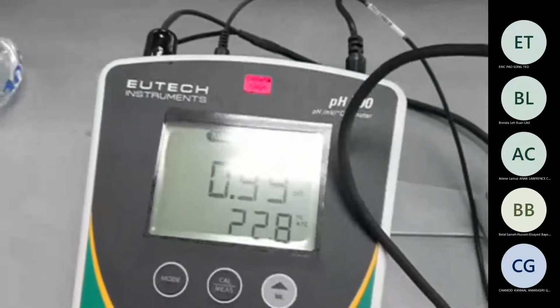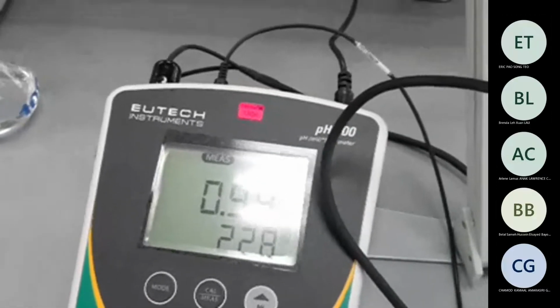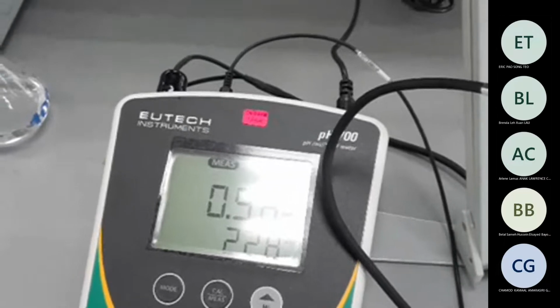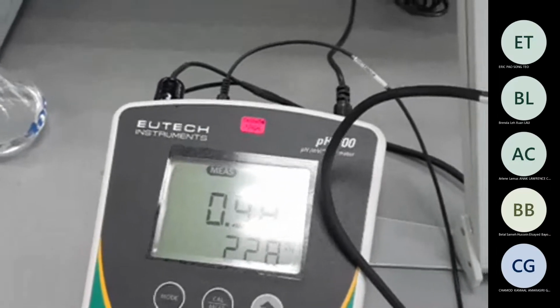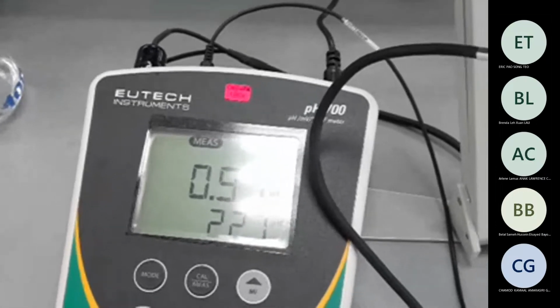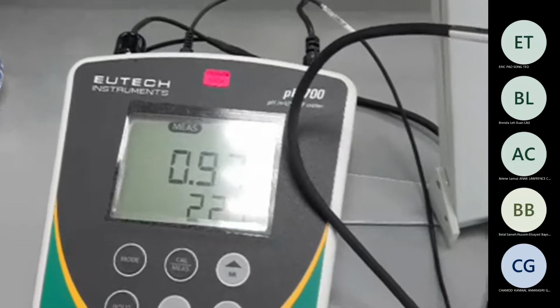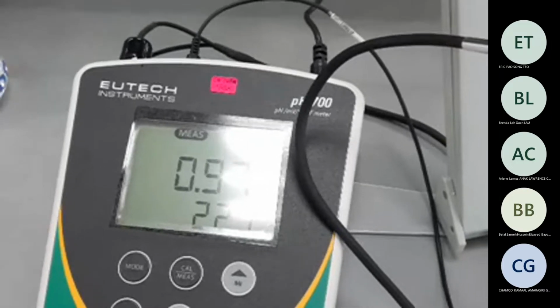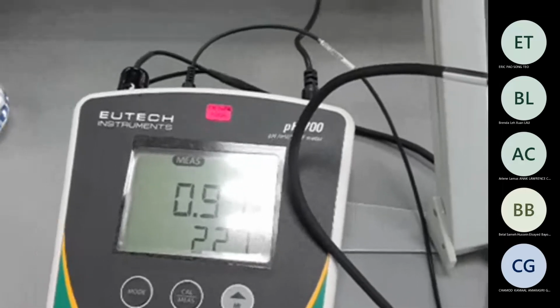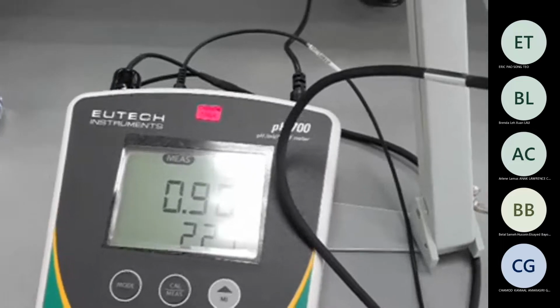The pH will fluctuate, not always stable, but around that we know it is around 1, or you can say 0.9798, around that. Okay, this is the pH of HCl that we are doing.